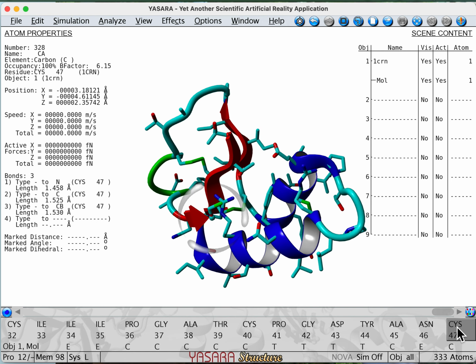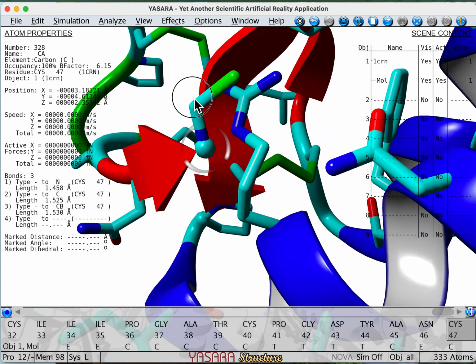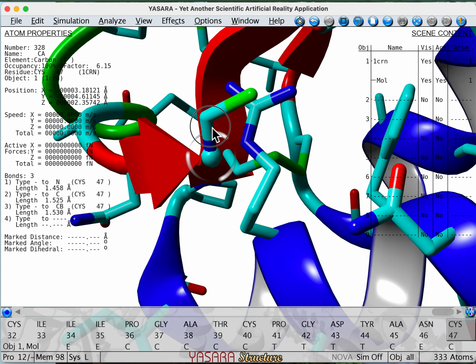If we click on the abbreviation of cysteine or the number, you can see a moving circle called fireflies zoom in to the location. If you'd like to see it closer, right-click on the cysteine and choose Zoom in on residue, and the entire structure will move closer to allow you a better view. Remember, you can always orient it in the orientation that allows you to see it best. And to return the model to the center, choose the blue button with the 4 arrows pointing in different directions at the top.